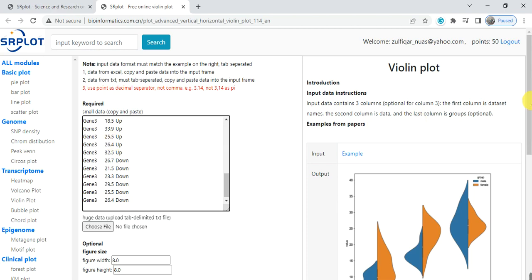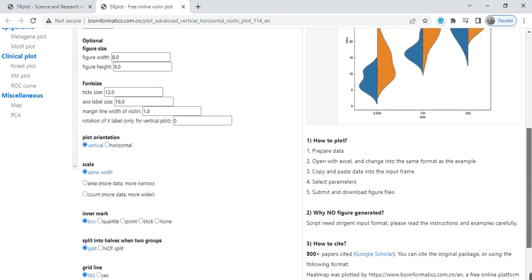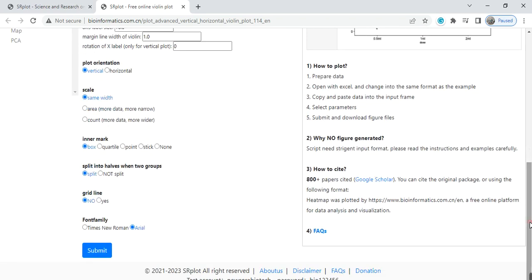And here are some options if you want to change the figure width, height, or tick size, whatsoever. If you want it, it is okay. If you want to keep them as default, it's also okay, and then click on submit.